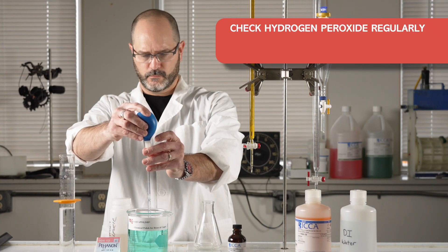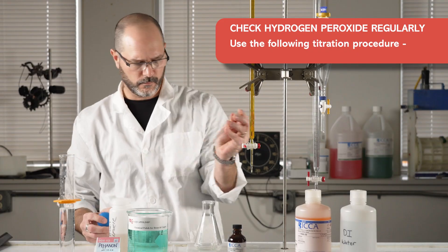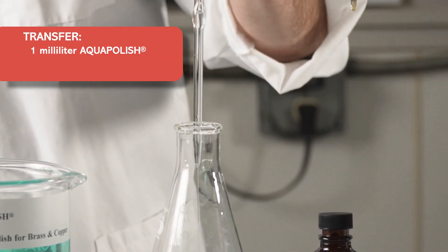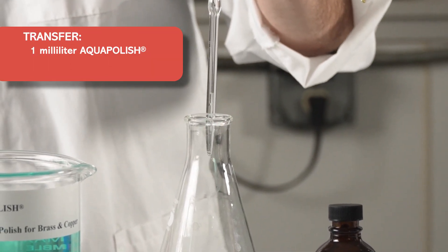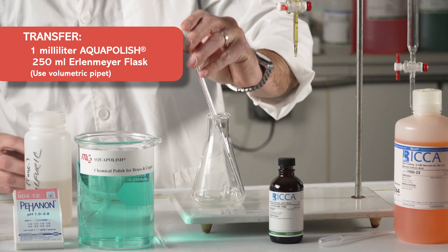The hydrogen peroxide concentration should also be checked regularly using the following titration procedure. Transfer 1 mL of the AquaPolish process bath into a 250 mL Erlenmeyer flask using a volumetric pipette.